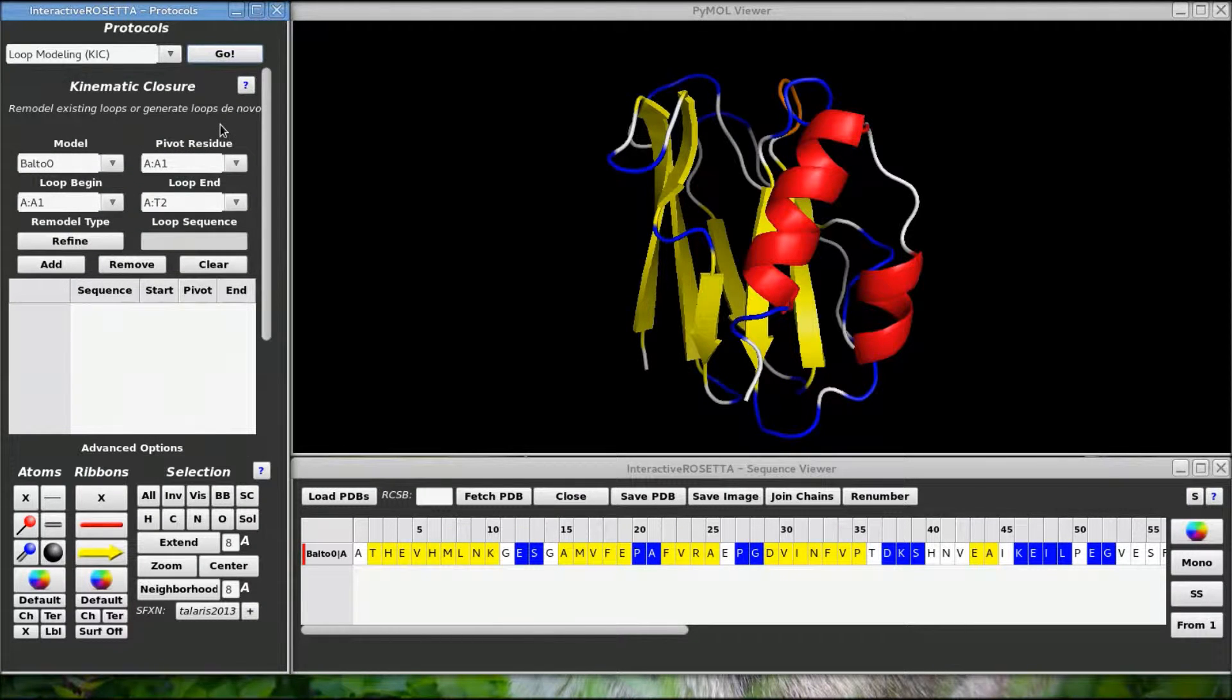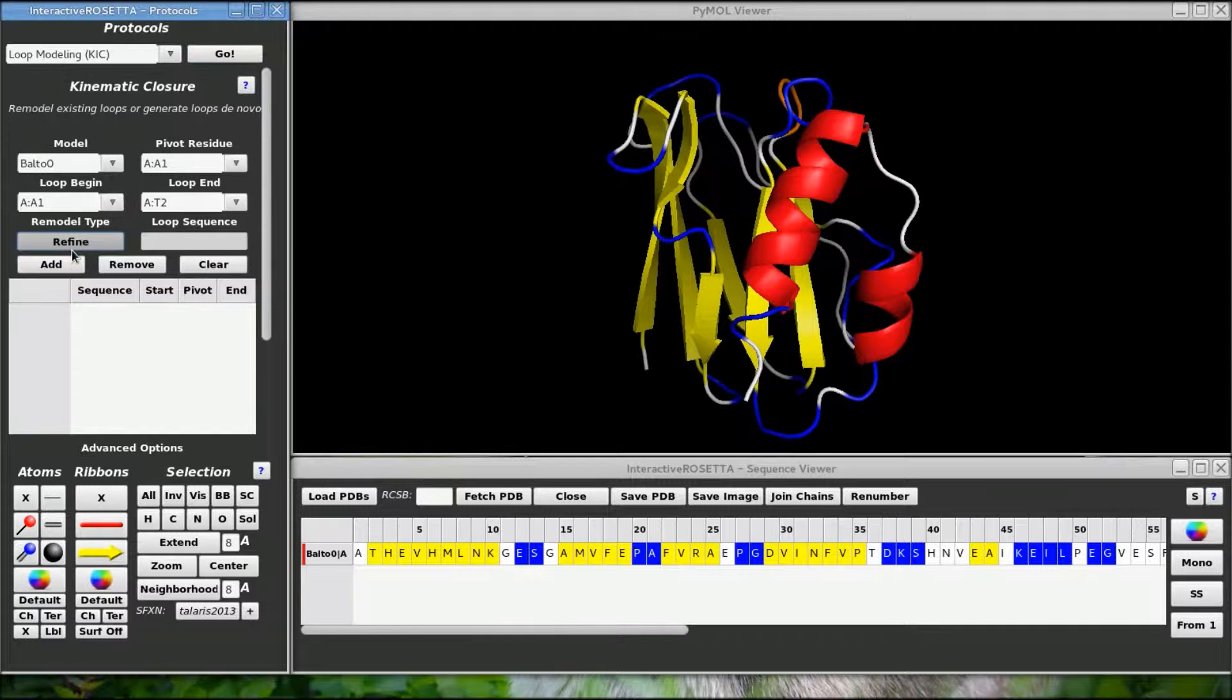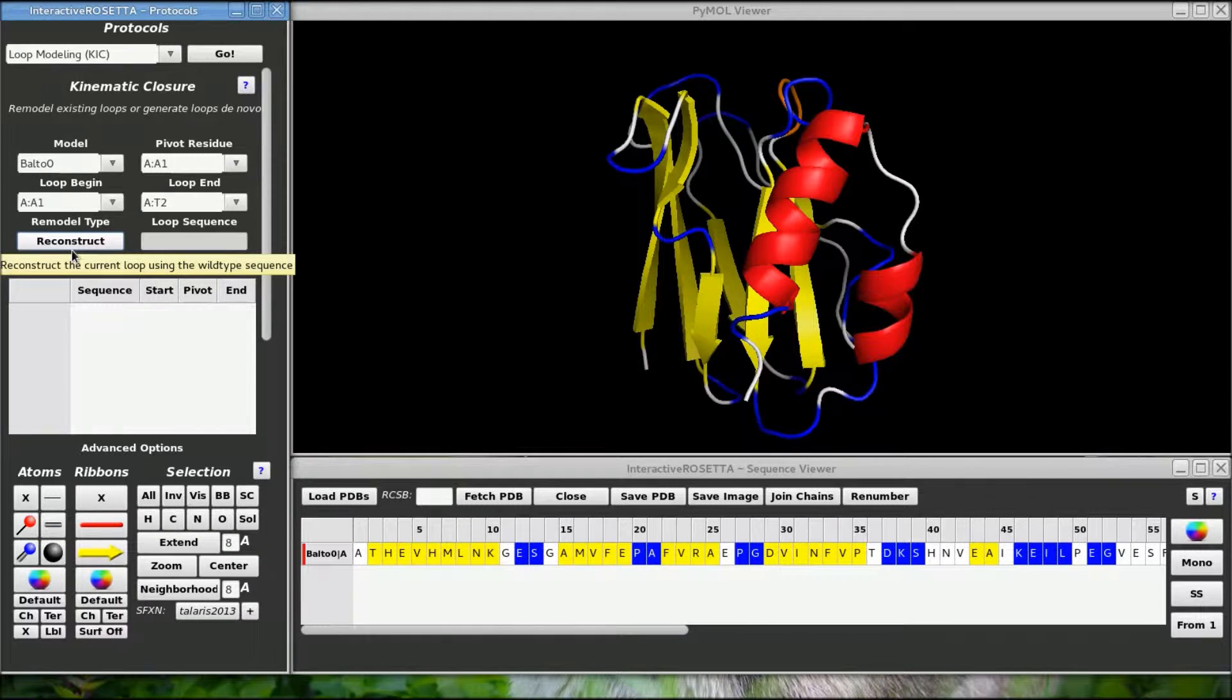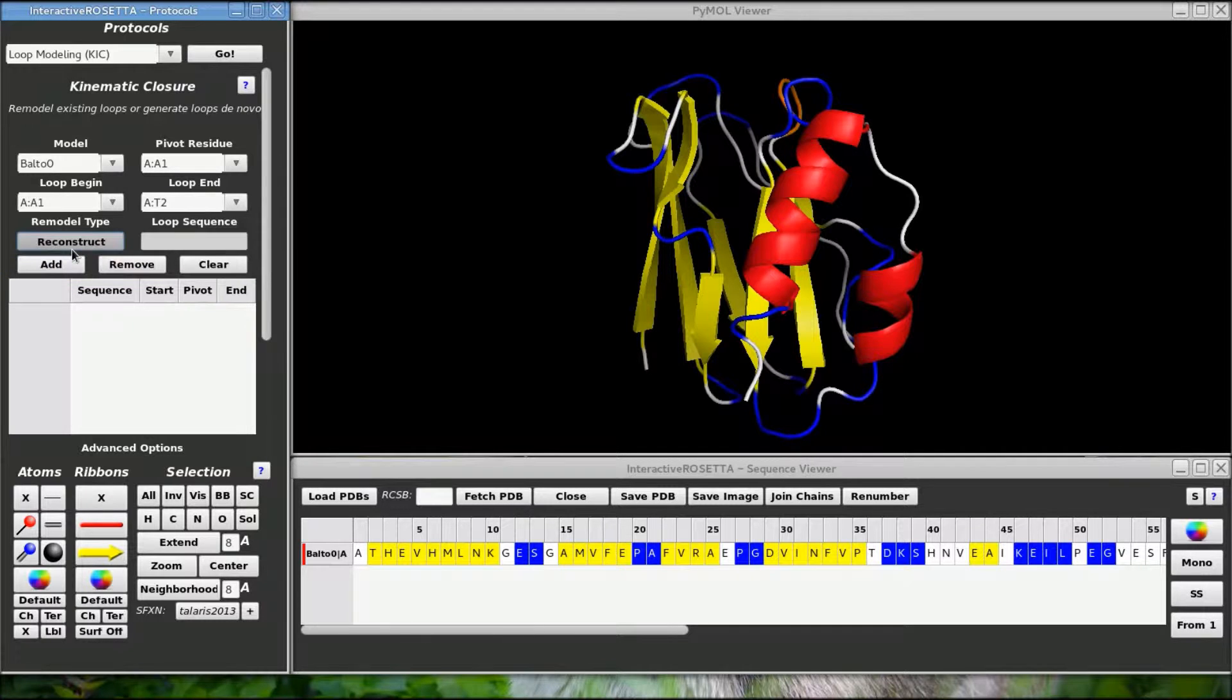There are three main modes for KICK. Refine mode performs only high resolution KICK on your loops. Reconstruct mode will perform the entire KICK simulation, including the initial low resolution sampling step, so you will be able to sample more diverse loop conformations.